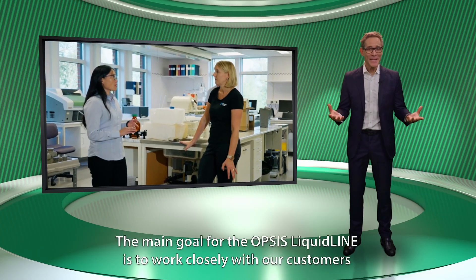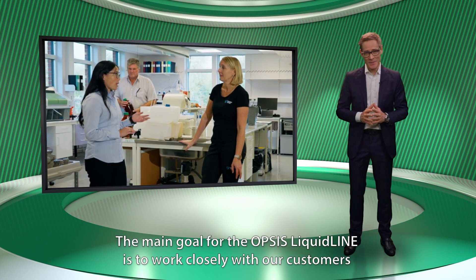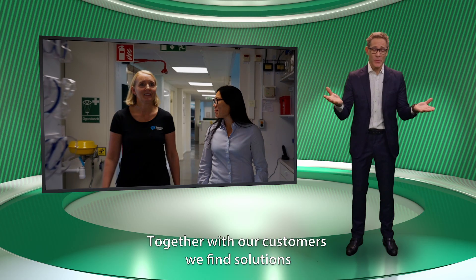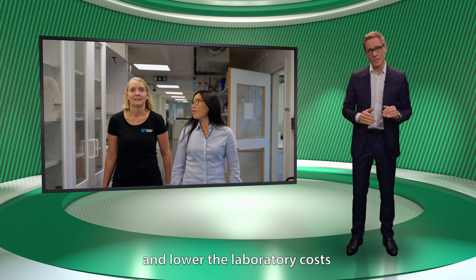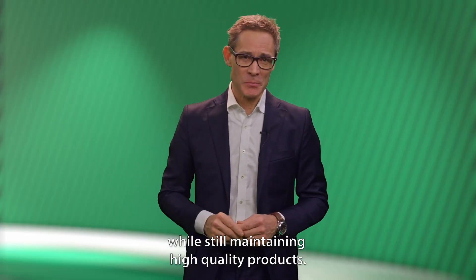The main goal for the OPSIS LiquidLINE is to work closely with our customers and learn from their experience and feedback. Together with our customers, we find solutions that increase efficiency and lower the laboratory costs while still maintaining high quality products.